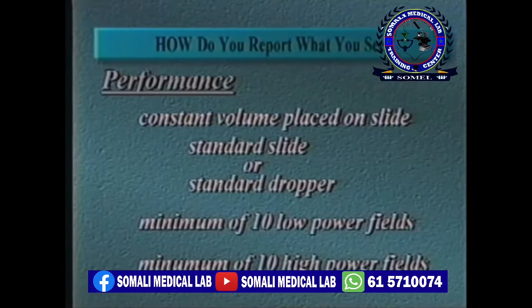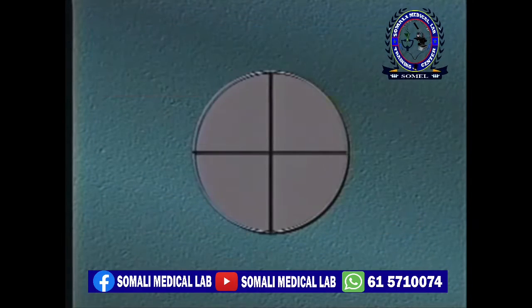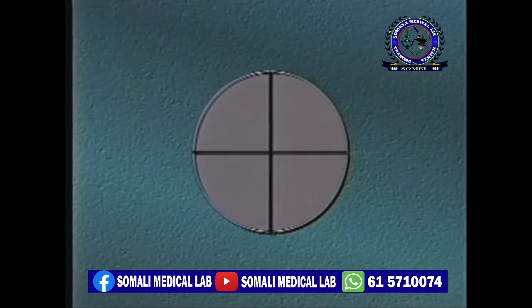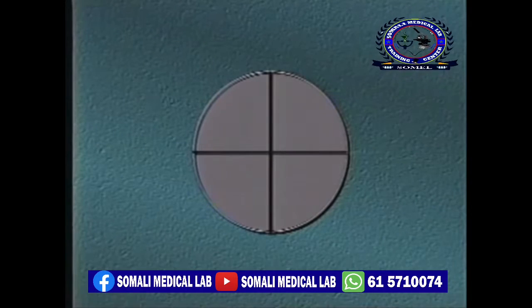A minimum of 10 low-power and 10 high-power fields should be examined. There are inexpensive ocular inserts that may be used to divide the microscopic field into quarters. These inserts help in enumerating cells, especially when you have a lot.